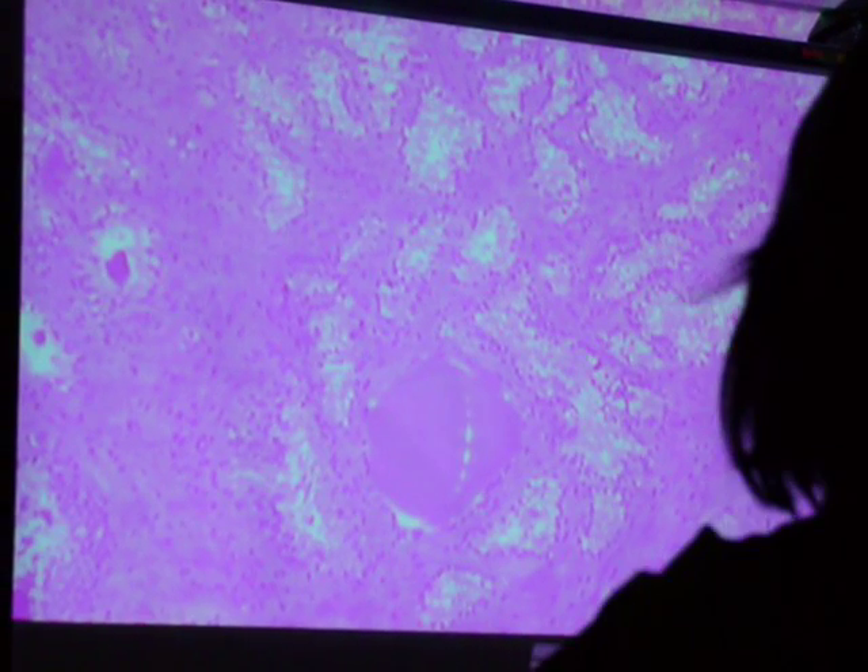We'll look for some better shots of this, but this big pink stuff here is the prostatic concretion. I'm going to go to a lower power. That dark pink spot there is prostatic concretion. There's some right there in that big open space — that's prostatic concretion as well.